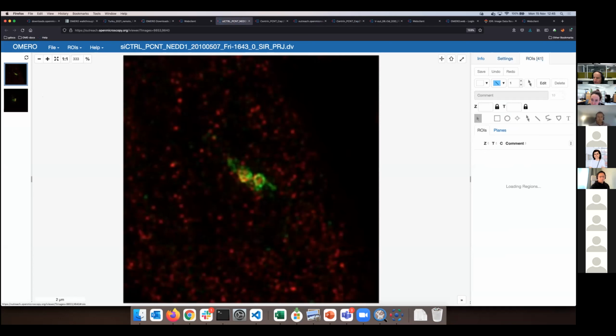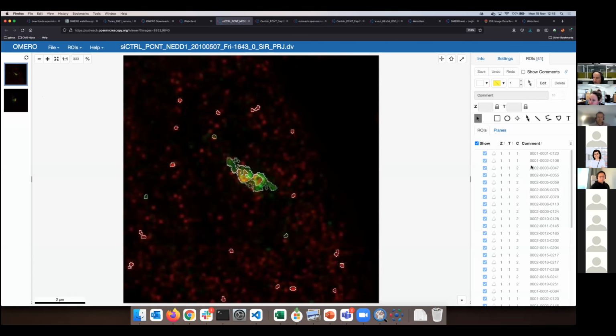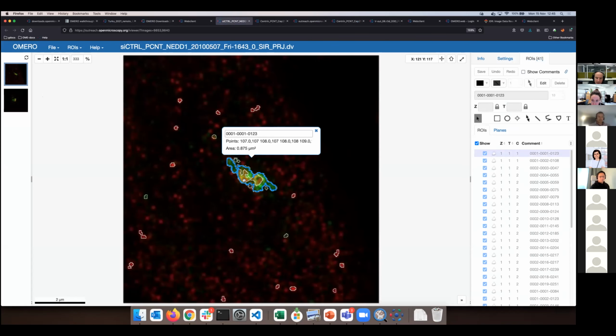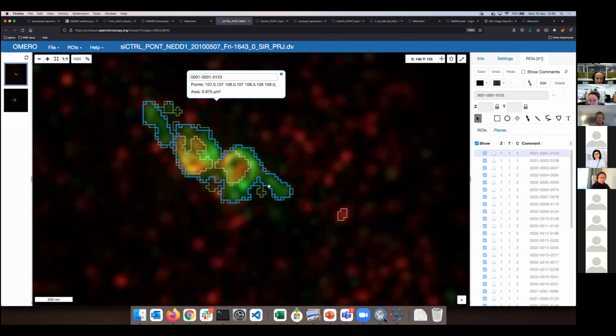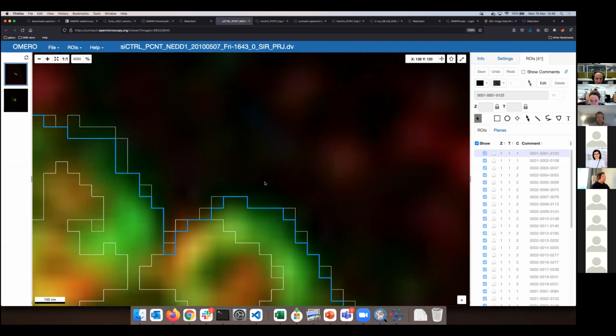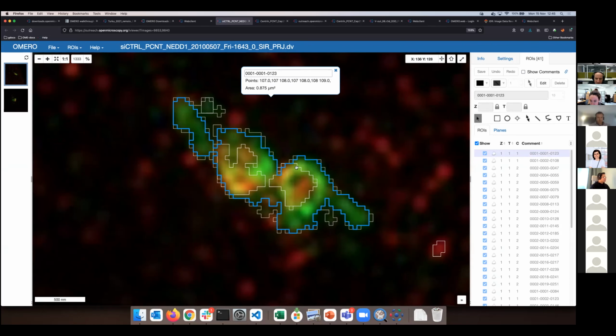And as previously, I will navigate to the ROI tab, and I can see in the Omero iViewer what is it that is making the bounding box so big and the area so small for it. So I have here two centrioles. It's quite small objects, 1 and 2, and these are the centrioles which should have been segmented by Fiji. Nevertheless, in this case, it didn't go that well.